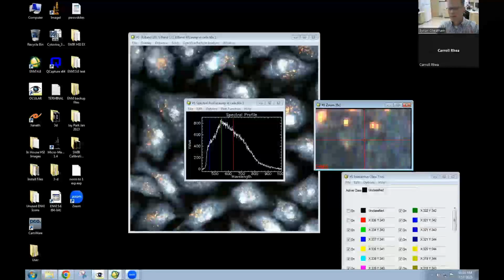Now, we talked about these nanoparticles being originally about 40 nanometers. There's a couple of things to consider here. We're not looking at the nanoparticle. We're looking at scatter from the nanoparticle, from the surface plasmon resonance. And we're also looking at the Mie scatter from the cell structure here. And we're going to talk about how we create this image and the mechanics and engineering behind it in just a second.